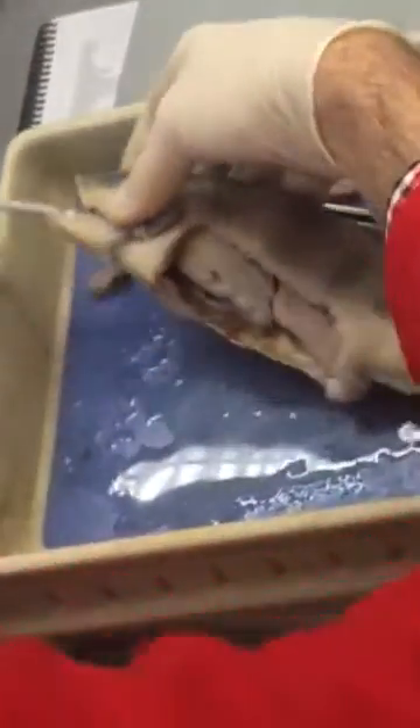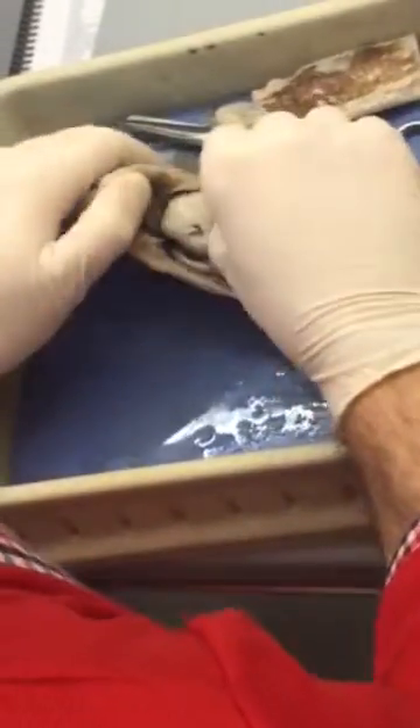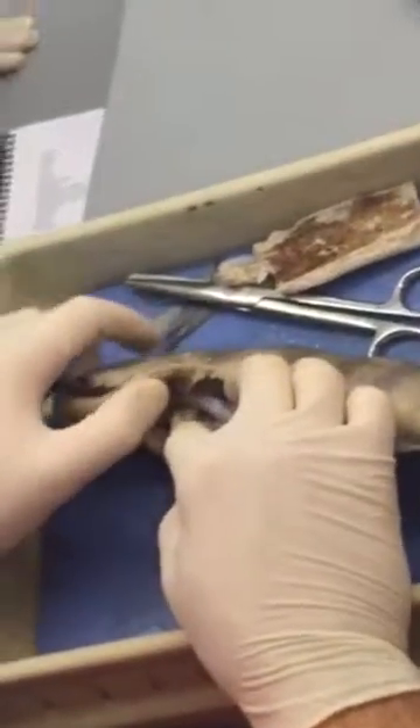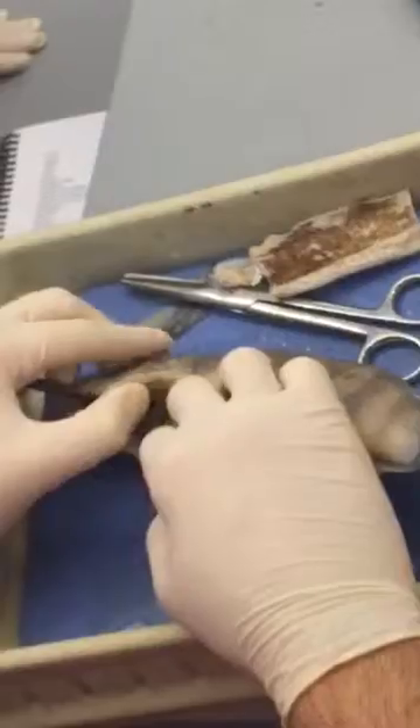Your probe — if you thread your probe in through the buccal valve this way, you should be able to find the esophagus. You know you're not damaging anything because you're doing it very softly and gently. I can feel my probe right there now. I've moved everything out, I can feel my probe is there, and now I know that that's the esophagus.